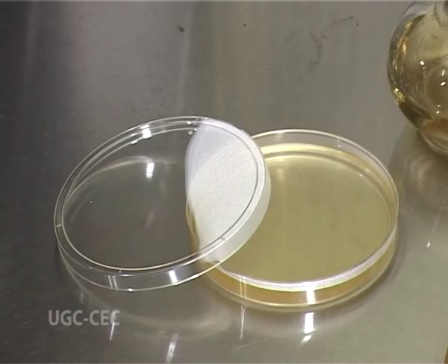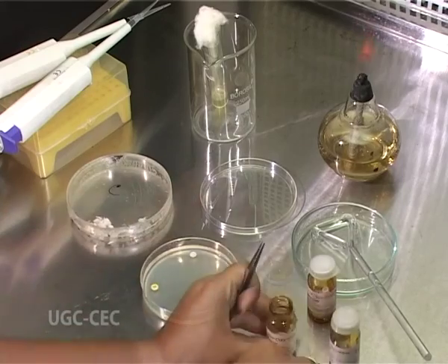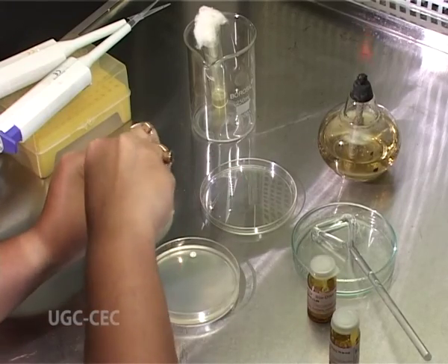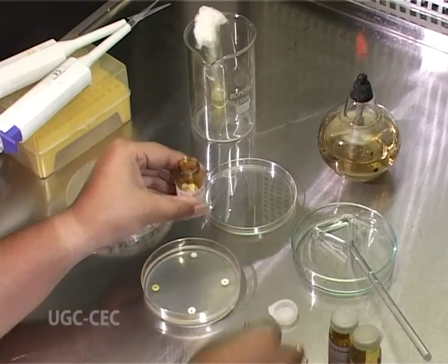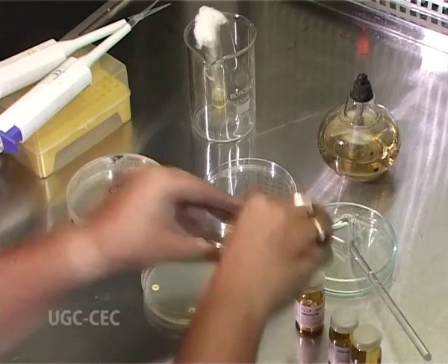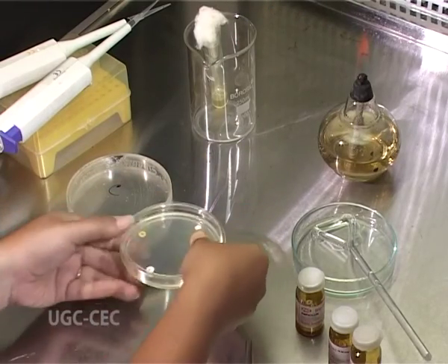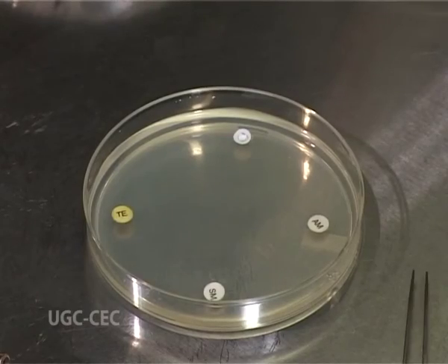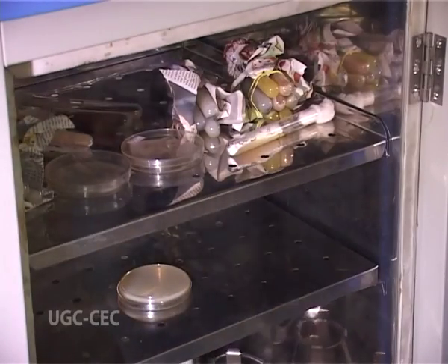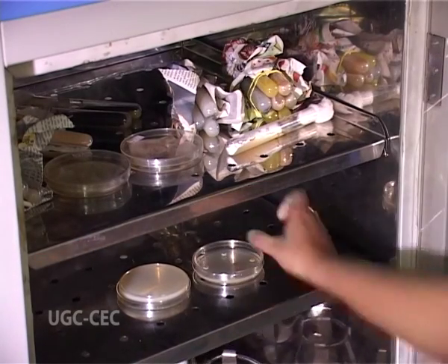The appropriate antimicrobial discs are placed on the agar using a forceps as shown here. And the discs should not be placed closer than 24 millimeter. That means ideally not more than 6 discs should be placed in a particular Petri plate. And then the Petri plates are incubated at 37 degrees centigrade for 24 hours.